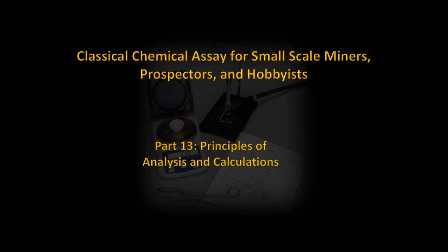In part 12 of this series, I focused on the requirements for a good precipitate and the issues regarding contamination. It was the starting point for gravimetric analysis. This presentation will be focused on the principles behind the derived values and how they are actually calculated in practice.